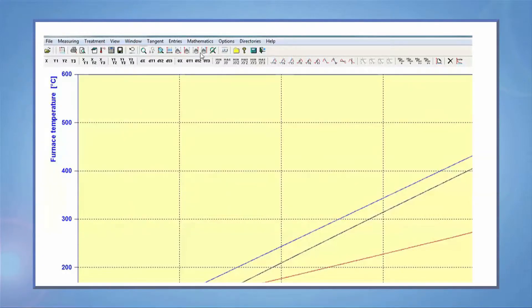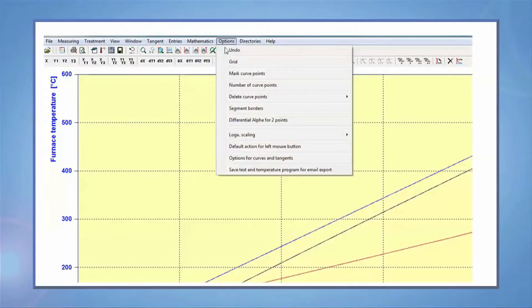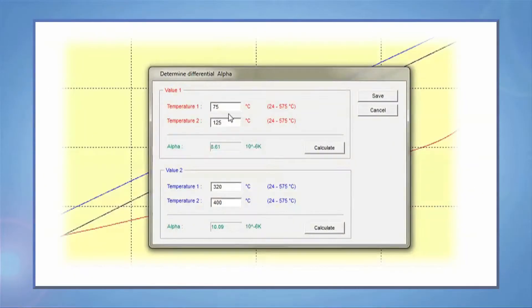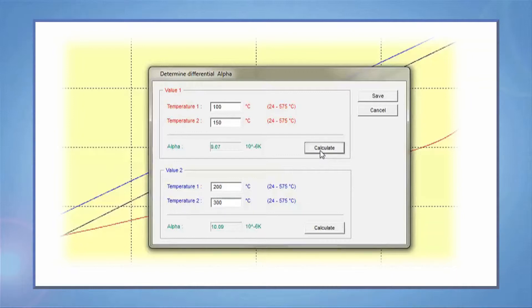To view alpha values, you can directly go to options and select differential alpha for two points. From there, you can enter the two temperatures that you would like to get the alpha value for. Press calculate. The unit for alpha is parts per million per degree.